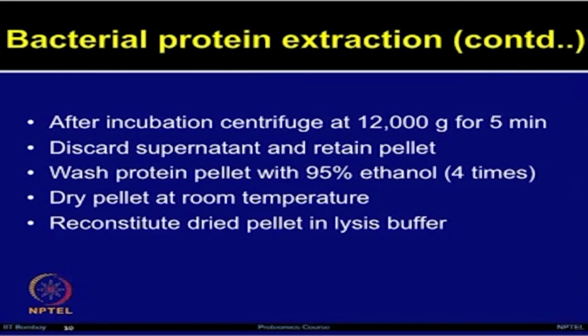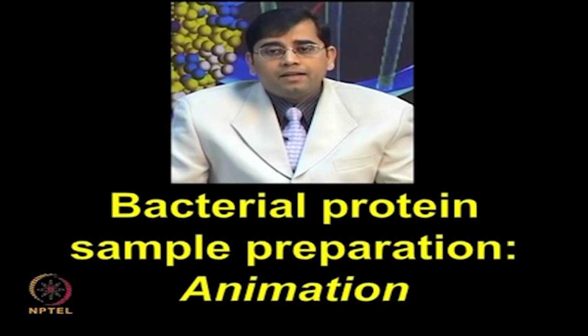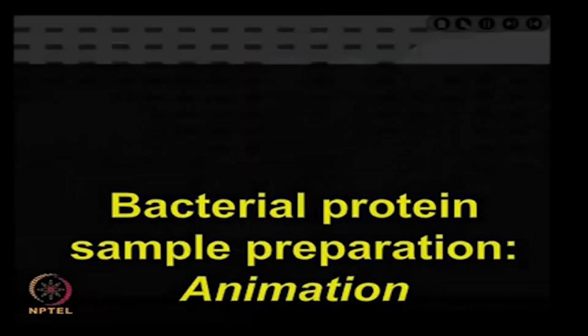If you are going to perform 2-dimensional electrophoresis, you need to add the lysis buffer, which contains urea, CHAPS, thiourea and different other components which we have talked about previously. Or if you want to analyze on SDS-PAGE, you can add the Laemmli buffer. So, depending upon your application, you can reconstitute the dried pellet in the right buffer composition. Now, let me show you the bacterial protein sample preparation in the interactive animations.